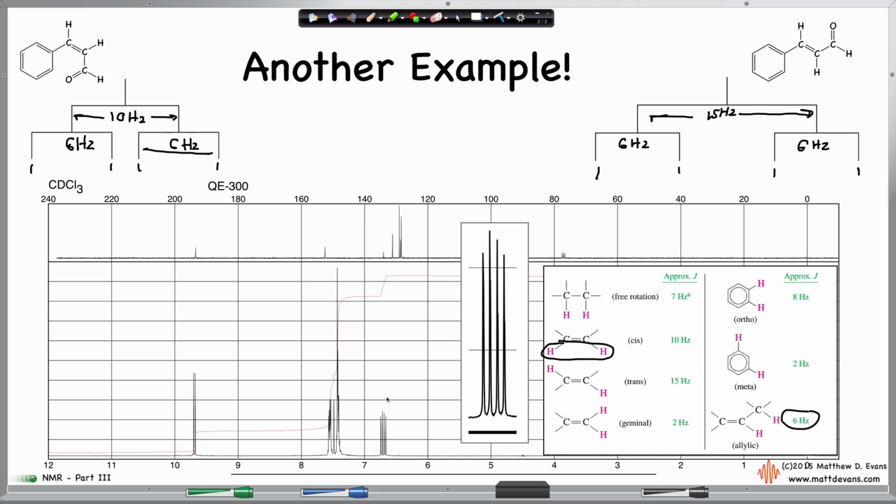So then when we finally look at the actual signal in an actual NMR spectrum for, I just came with the answer, trans-cinnamaldehyde, we see that this pattern, this is the zoomed in one, looks a lot more like this one, where the gaps are pretty much the same. You see the gaps here are pretty much the same, versus big gap, small gap, big gap. That's not what we have. And so the true structure of this is not that one. It's actually this one. We use coupling constants to prove that.